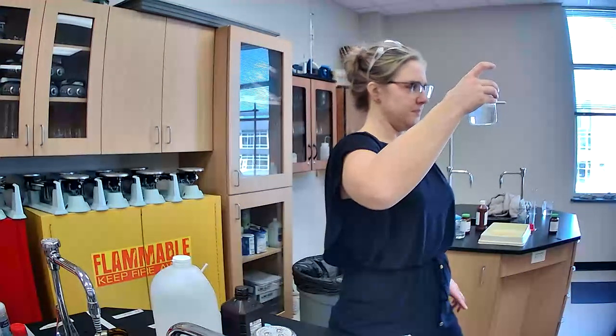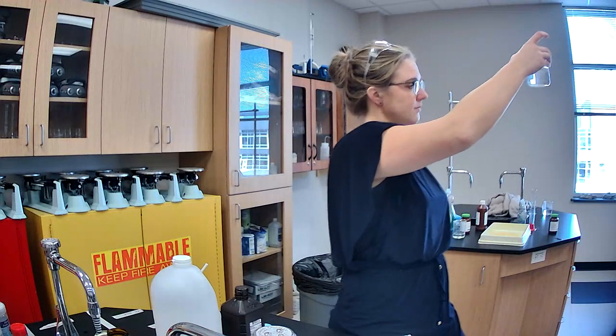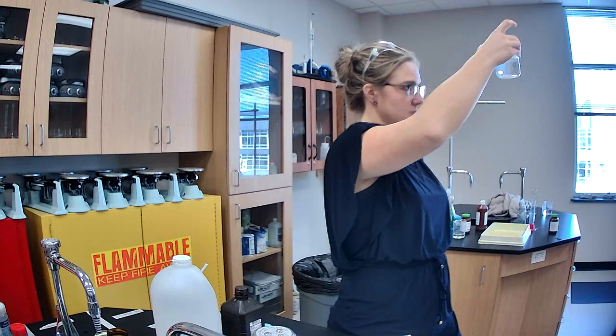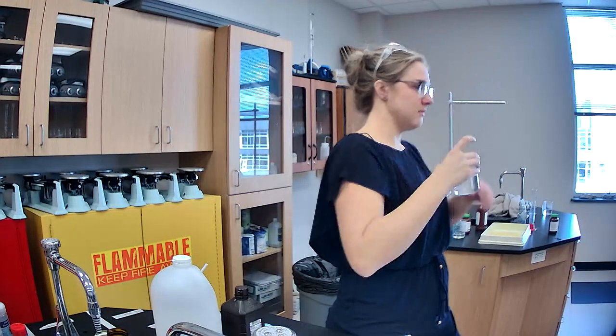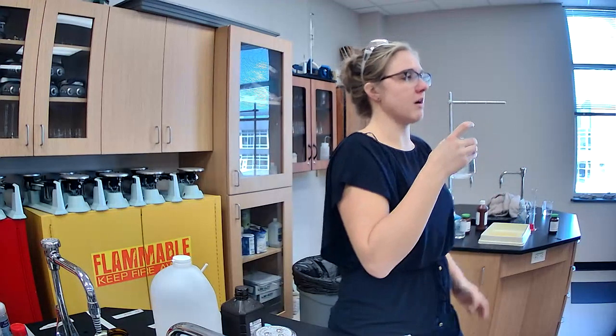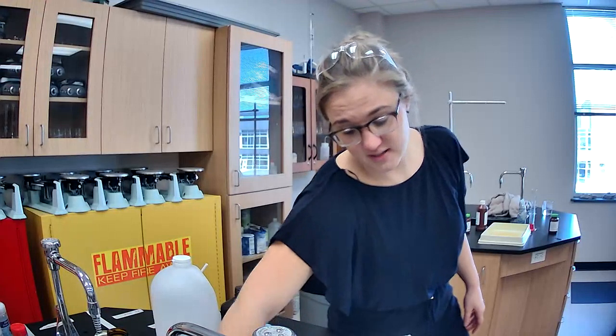And it makes carbon dioxide? Carbon dioxide gas, as it bubbles out. Brooklyn? No, it doesn't fill up. More like soda, actually. Yeah, like, not sweet soda, but just carbonated water. It is just carbonated. That's pretty much all it is, yeah.